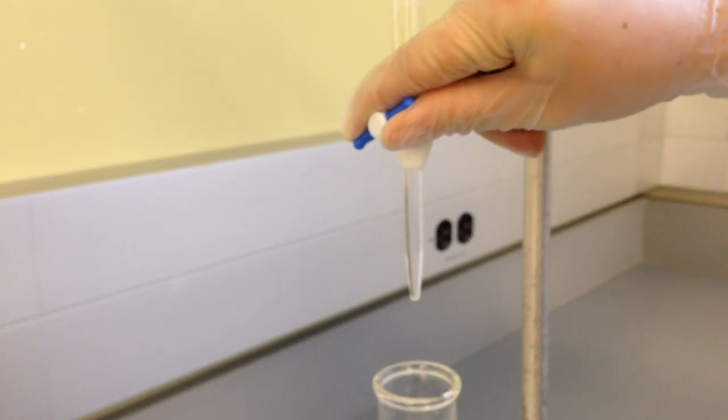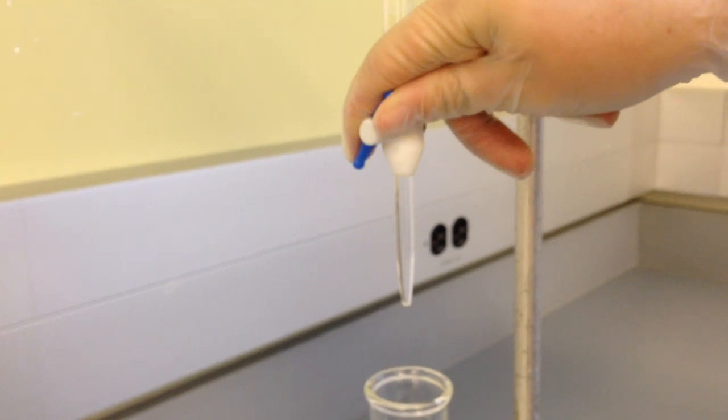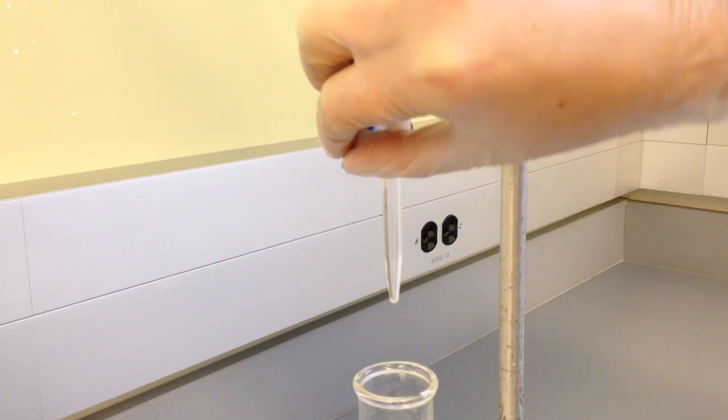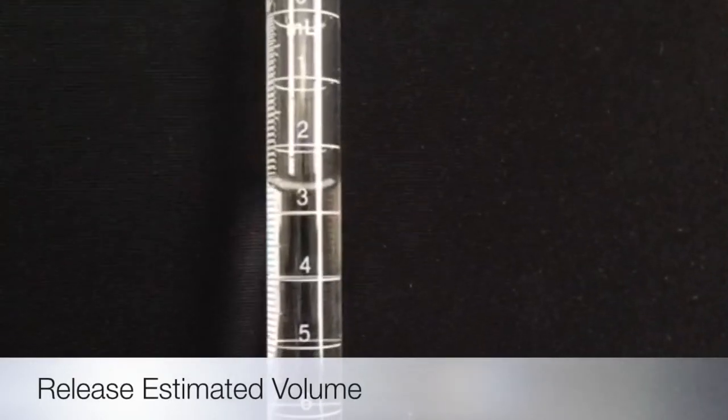To begin your titration, turn the stopcock from the closed horizontal position to the open vertical position, as shown. Enough titrant should be added to get near the endpoint. This allows an accurate titration.